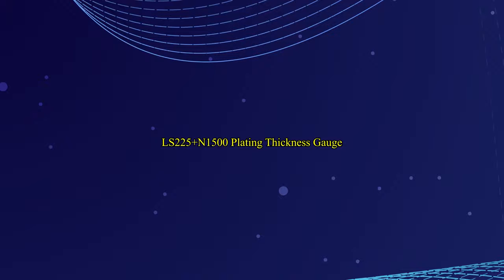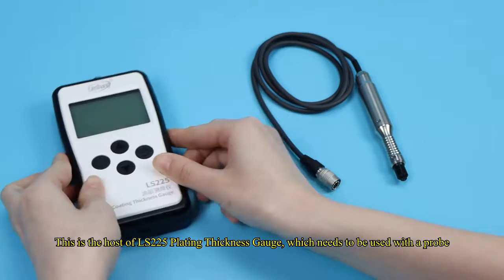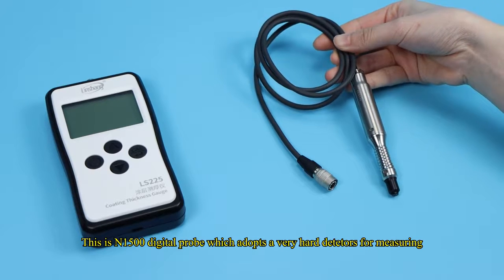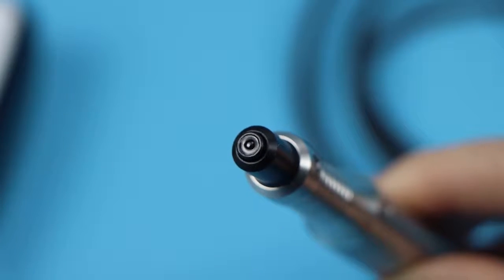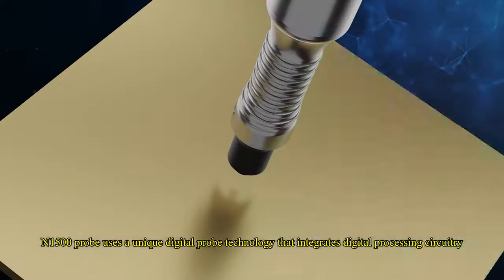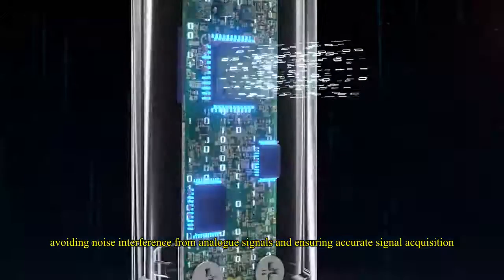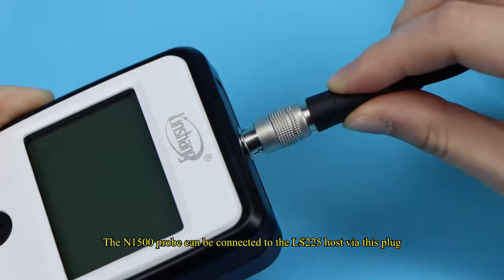The LS-225 plus N-1500 plating thickness gauge. The LS-225 is the host unit, which needs to be used with a probe. The N-1500 is a digital probe that adopts very hard detectors for measuring. It uses unique digital probe technology that integrates digital processing circuitry, avoiding noise interference from analog signals and ensuring accurate signal acquisition. The N-1500 probe connects to the LS-225 host via this plug.